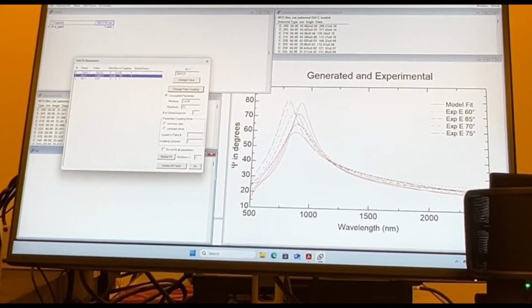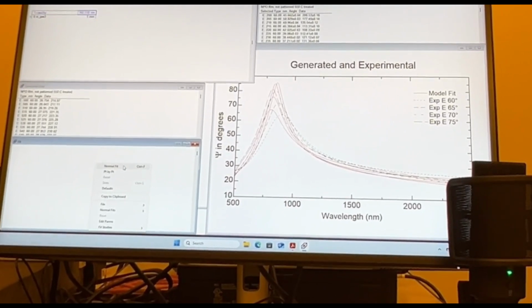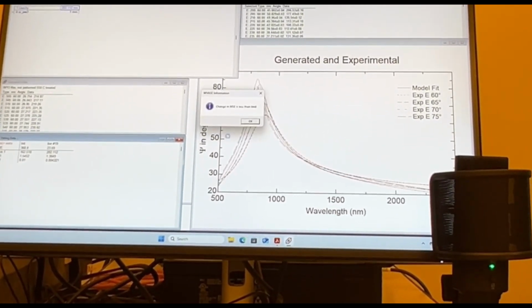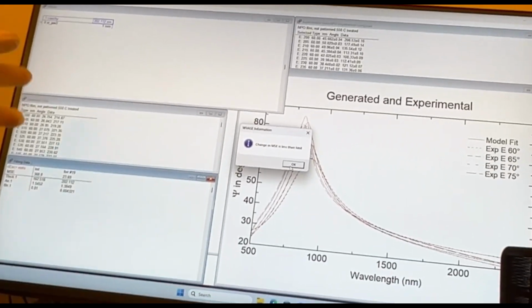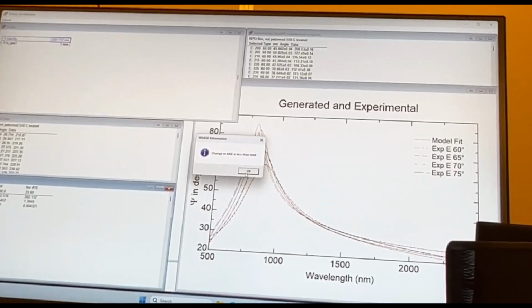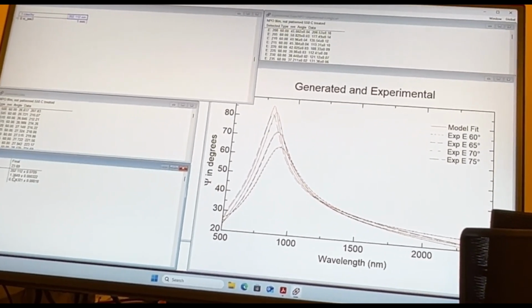So at the end of the day, usually if you're just fitting a Cauchy, if we can assume it's transparent, we can say I'm close enough now, let the software fit this. So Control F or right-click normal fit, or highlight here and come up to normal fits and say normal fit. So there are different ways to get there. We can say, hey, let the software adjust those parameters to get the best match. The thing is, I need to be somewhat in the ballpark. If my peak was way over here and I said fit, it's too far away from the right solution to figure it out. So currently it looks like this wants to be, at least for the measurement we did, close to 200 nanometers, a relatively low index.